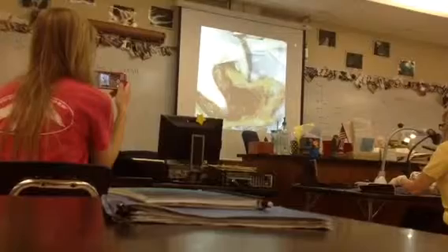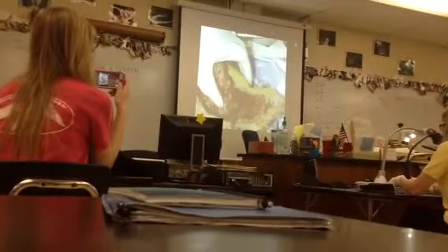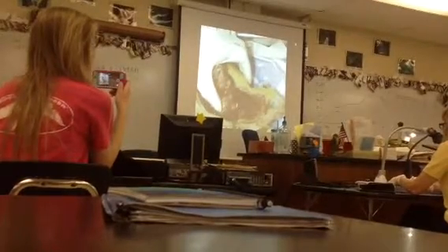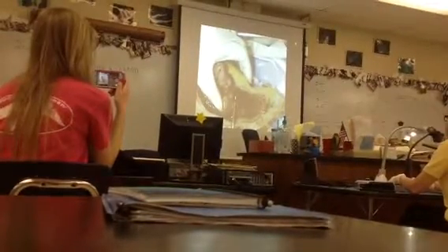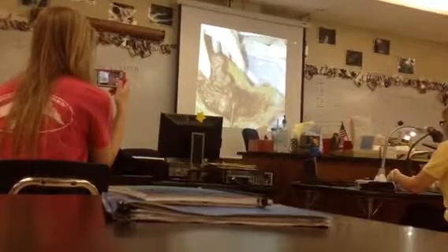Okay, then going into the stomach up here, this is the esophagus. And so I will have the liver pulled and you'll be able to see that esophagus going into the stomach, so the tube going into the stomach.